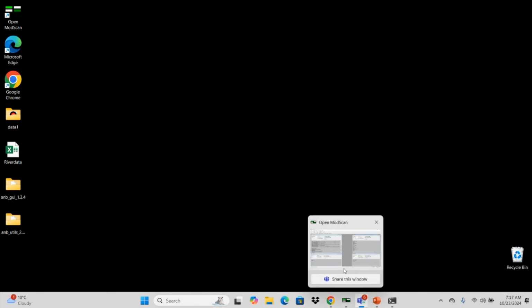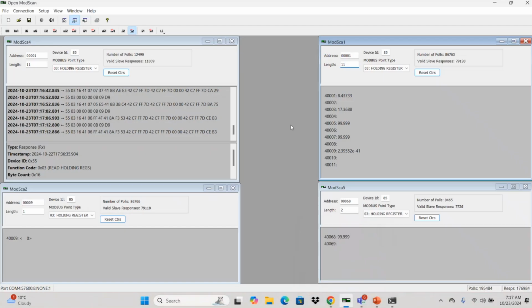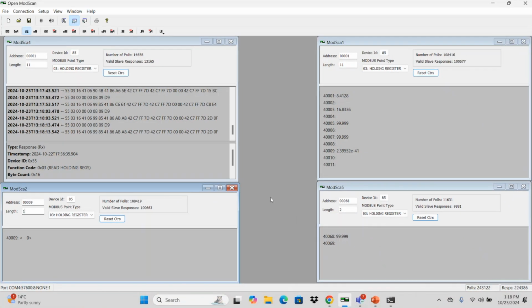So we've been asked over the last 3 to 6 months about our Modbus functions, and we've actually learned quite a lot. So today we're just doing a little demo of a sensor that's in autonomous mode. We've changed the way that we work in the Modbus interface, and this is based on really customer feedback. When the sensor was doing its reference check, it would output 99.99, and we understand that was quite a confusing message, seeing as it's one of our error codes or out of range codes. Now, when you start the sensor, you'll get a standard Modbus exception saying the sensor's either busy or waiting to be started scanning sequence. Once the sensor starts scanning, you can send a Modbus register read request.